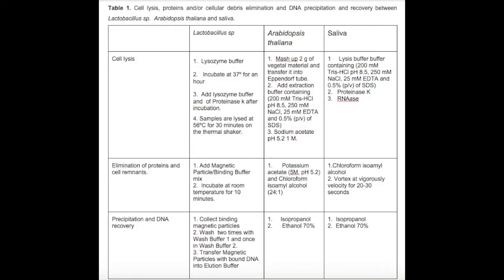Key is the use of different reagents for each of the steps of purification, mainly the cell lysis, because the cell wall and cell membrane have different components. Cells have cell membranes that are composed of phospholipids, and to degrade them it is necessary to use detergents or compounds that specialize in this type of molecular degradation.